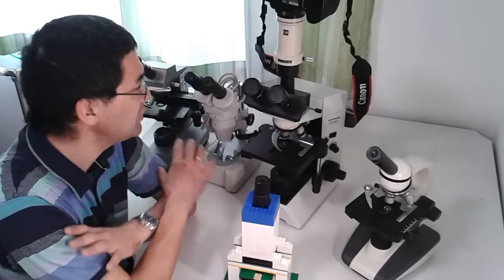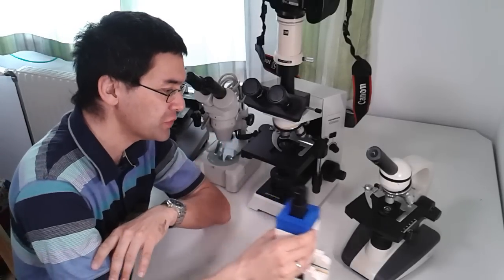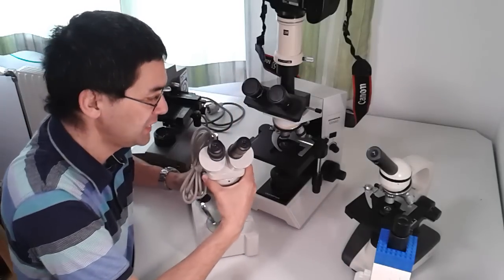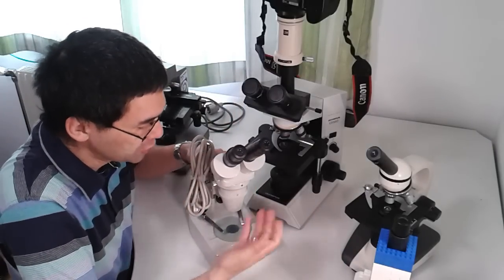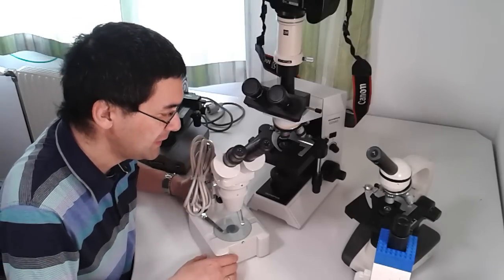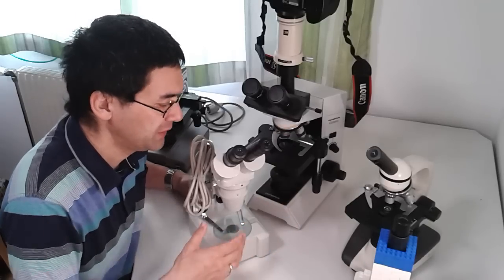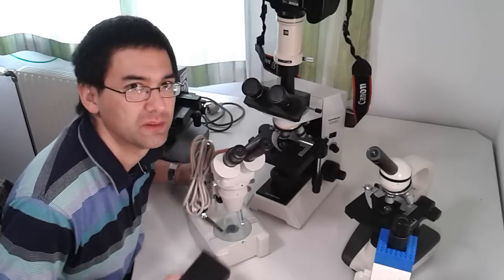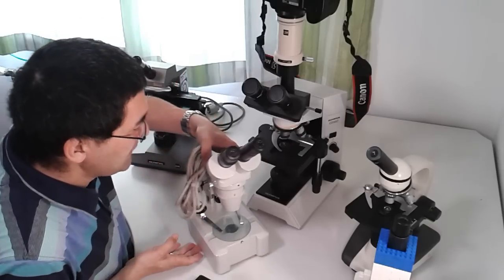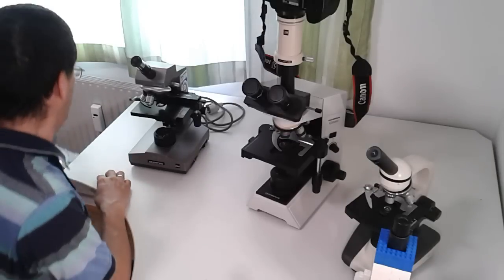I'm going to give you a quick run-through of these microscopes. One of them is a stereo microscope, so I'm not going to include it in the comparison later on — I'll just show it for the sake of completion. Because it's a different type of microscope, it can't really be compared with the others.